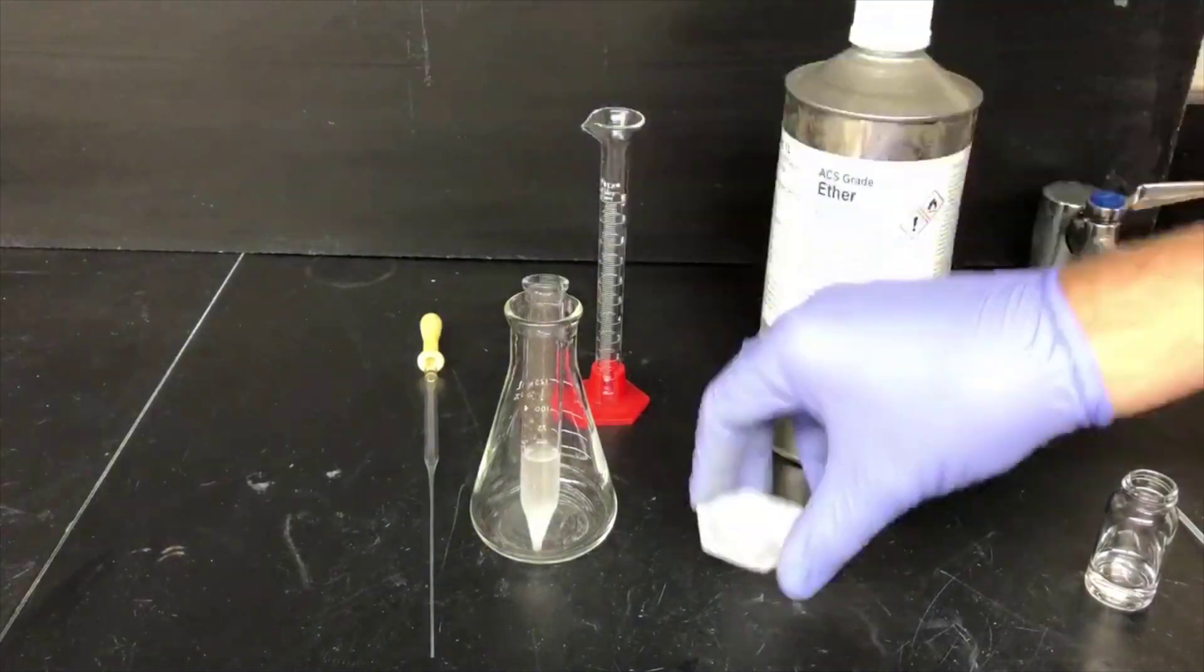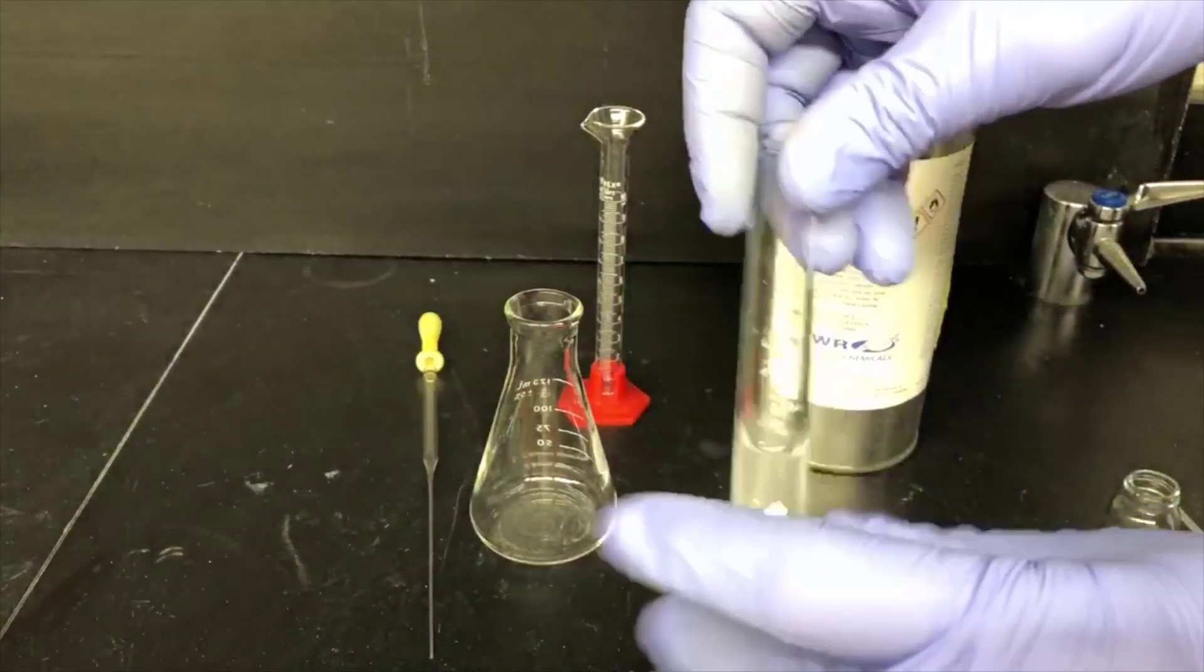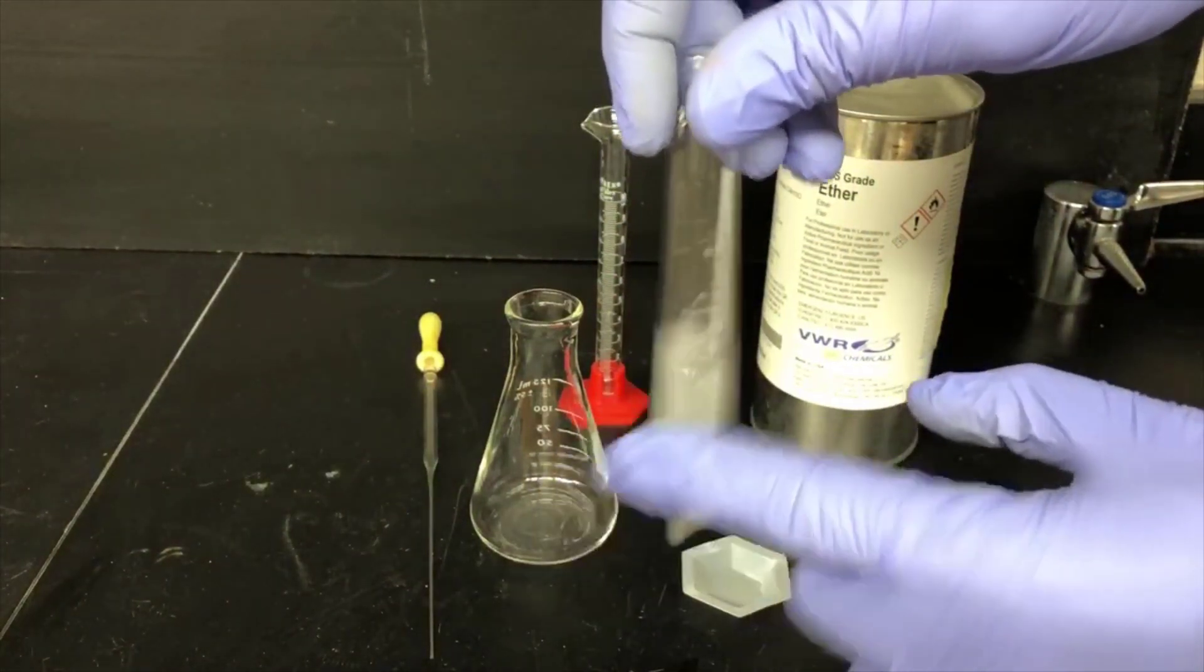Now I'm adding the sodium chloride salt that weighed out earlier, and I'll agitate the test tube to dissolve as much of the salt as possible.